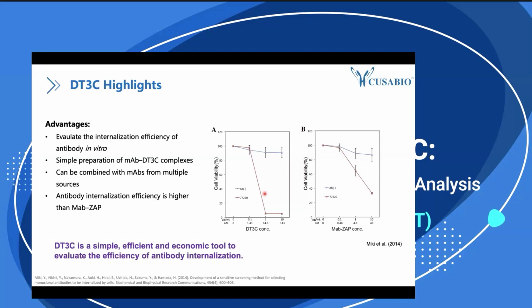So lastly, one more take-home message is that DT3C is a simple, efficient, and economical tool to evaluate the efficiency of antibody internalization, especially when you need to do some primary and initial screening of antibodies. DT3C will always be your best tool to choose.